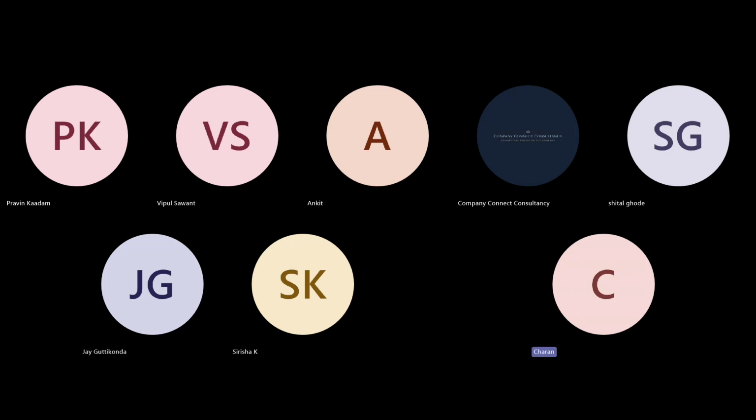So there is an integration; we can make an integration between SAP and the LIMS. Yes, definitely we have to do integration. Even in the lab, in the analysis and product fields, there are separate tabs for SAP entries. Some tabs will be there for SAP. After integration, the SAP details will be fetched into the LIMS.